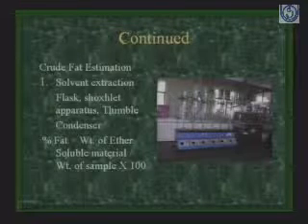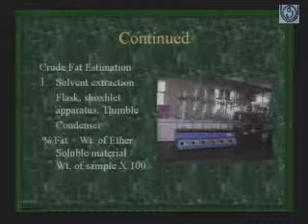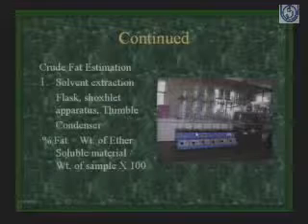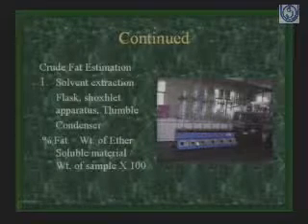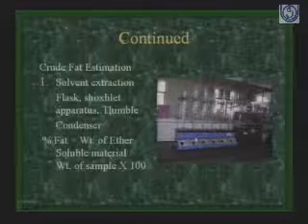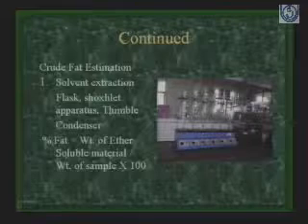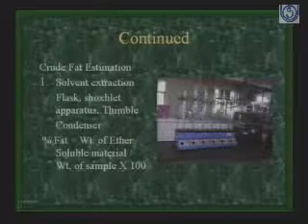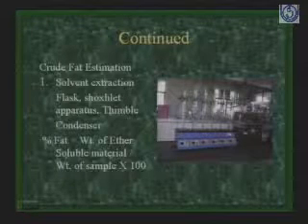So this is the solvent extraction. Soxhlet extraction units are there, you see in the figure. You put the sample into the thimble, put it into the Soxhlet, and put the petroleum ether into the flask. It is a low boiling organic solvent, so it boils at 60 degrees. So you maintain the temperature at 60 degrees, and through the Soxhlet condenser it passes again and again, and depending on the nature of food, it takes 5 hours, 6 hours, 8 hours, sometimes 18 hours.